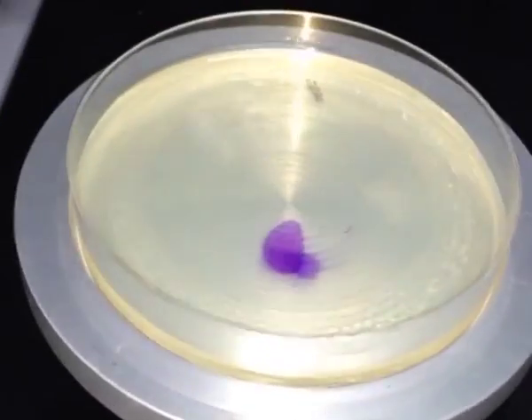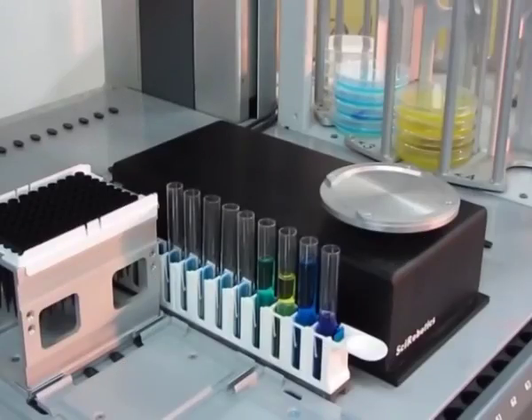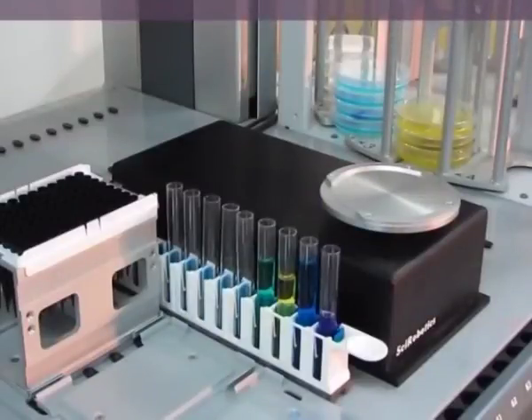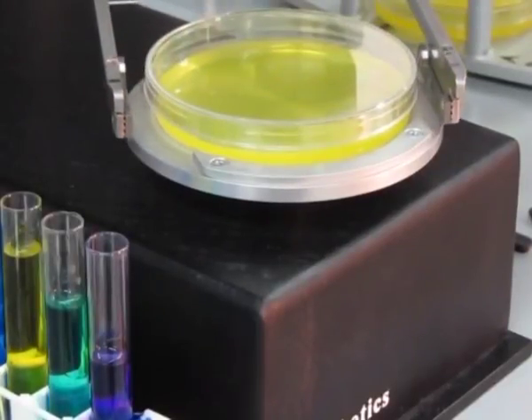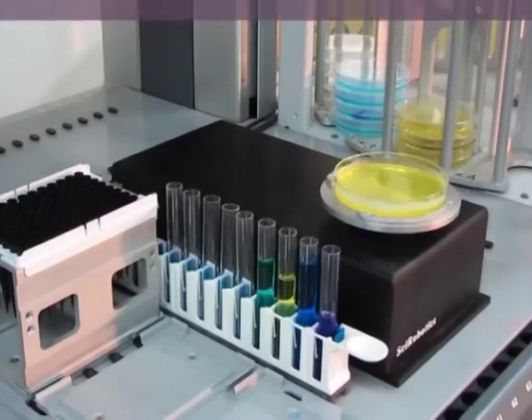The microbial concentration is determined by counting the colonies on a part of the petri dish where they are easily countable and dividing this count by the appropriate volume. One inoculation determines microbial densities between 500 and 5 lakh microorganisms per ml. Additional dilutions may be made for suspected high microbial concentrations.